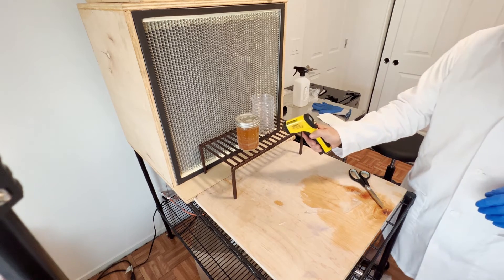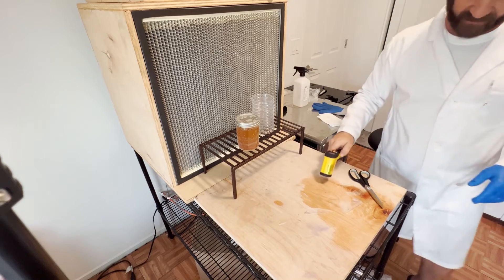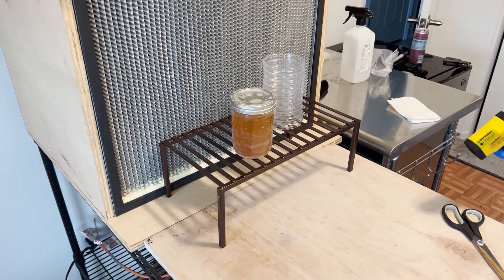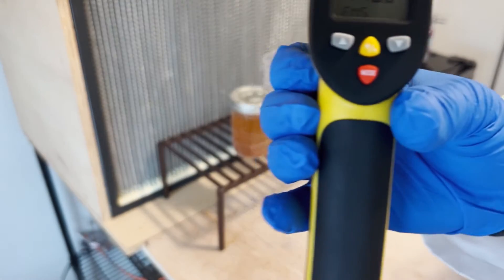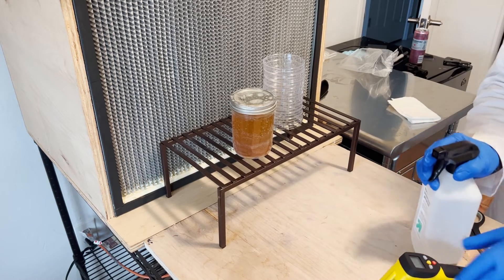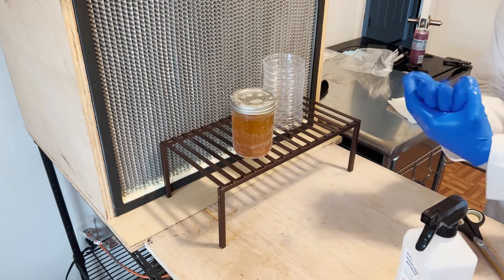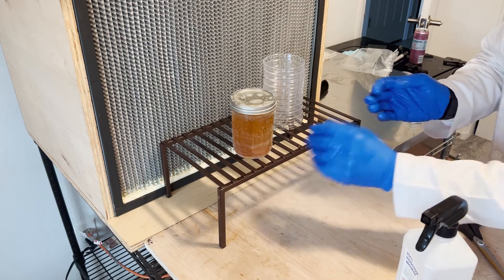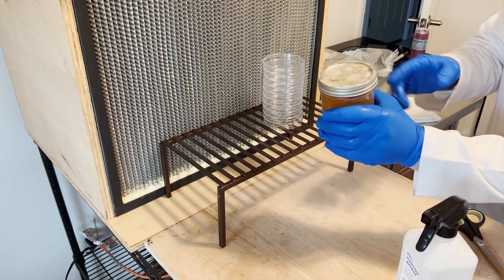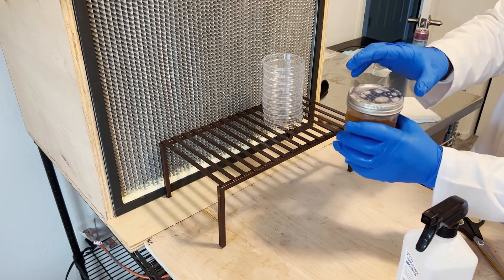Checking the temp one more time — down to 168, give it a few more minutes. Okay, we're at 119 degrees, so we're going to go ahead and get ready to pour. Getting the hands with alcohol again. We're going to give the agar a little stir — the stuff at the bottom likes to settle and we want to make sure the yeast and dry malt are distributed throughout so there's plenty of food all through the agar when we pour these plates.